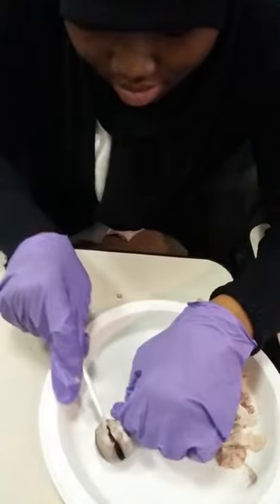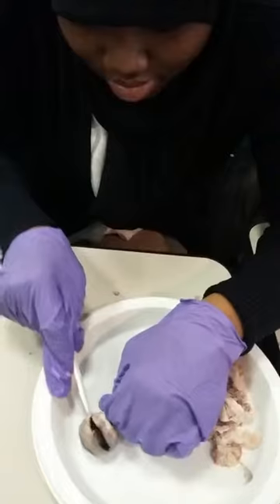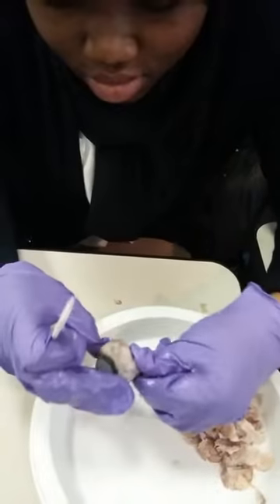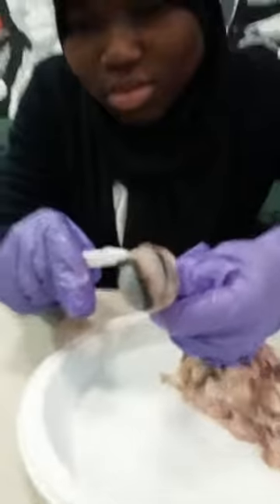There we go. If you scrape the retina away, you see where it attaches to the optic nerve? Right there. That's your blind spot. There are no rods or cones there. You're totally blind in that one little spot, but you can't tell because the rest of the retina gets the image.